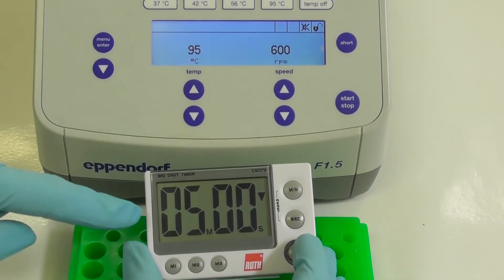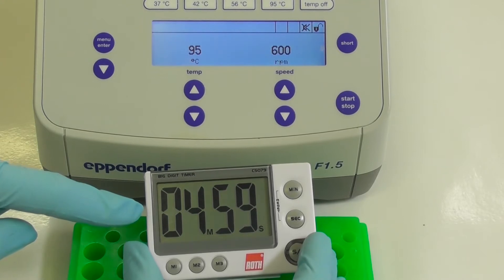Prior to gel loading they are placed in a heating block set to 95 degrees for 5 minutes.